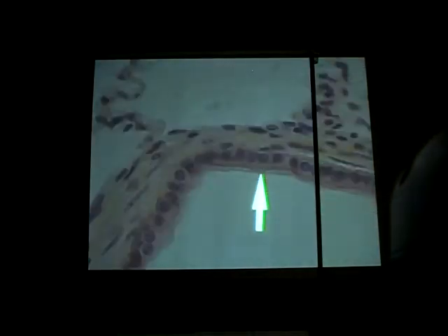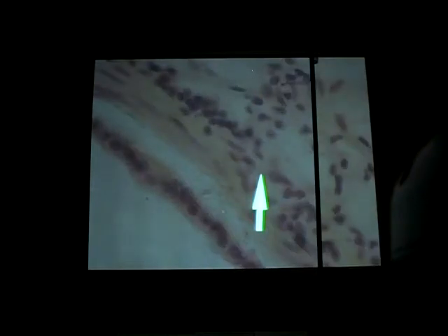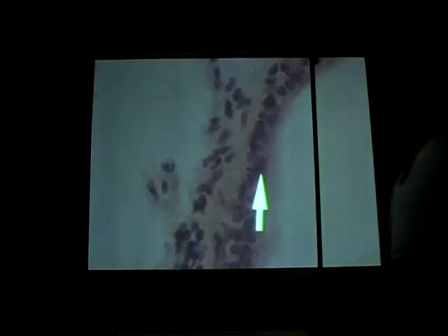Alright, so how would you classify the tissue here? Simple cuboidal, right. We're seeing simple cuboidal epithelium, and a little bit of smooth muscle surrounding it. Let's look around and see if we see any cartilage. Yeah, it can be columnar as well. We're not seeing any cartilage. We see our simple cuboidal epithelium, no goblet cells, nothing. So we know that we're now in the bronchiole. So that would be a bronchiole.